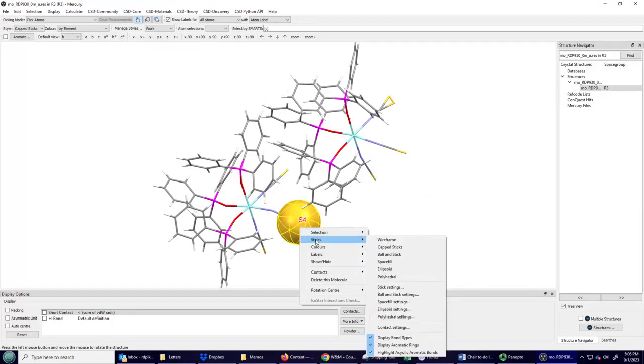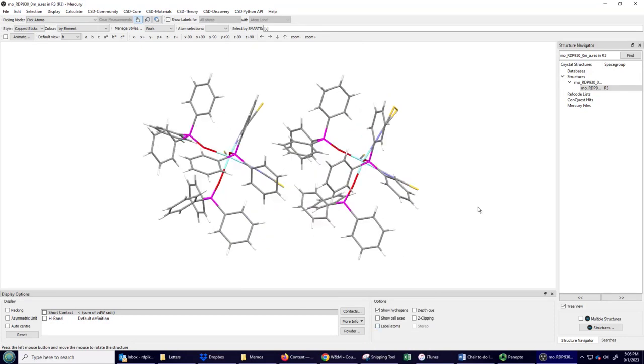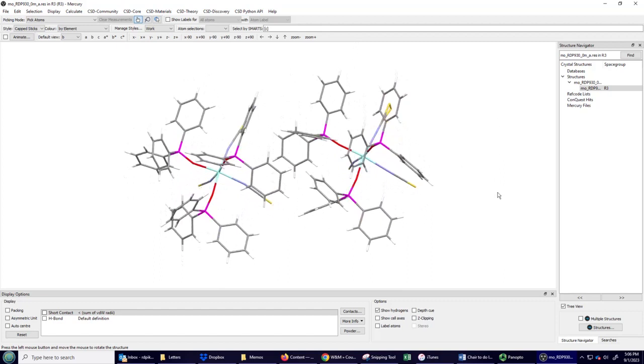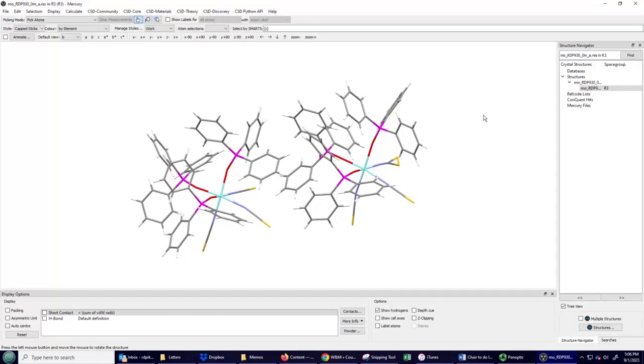We see their behavior in space. And remember, this is not some sort of computational modeling. This actually is an experimental result that came from making this compound, growing a crystal of it, finding how the X-rays diffract from that crystal and reconstructing the atomic positions from that X-ray diffraction map.